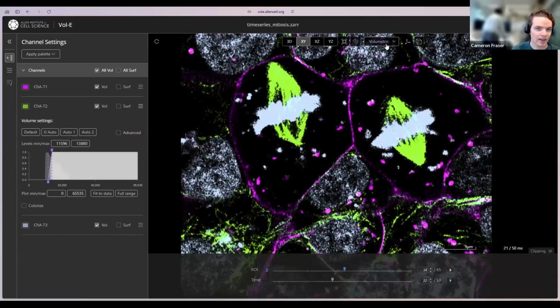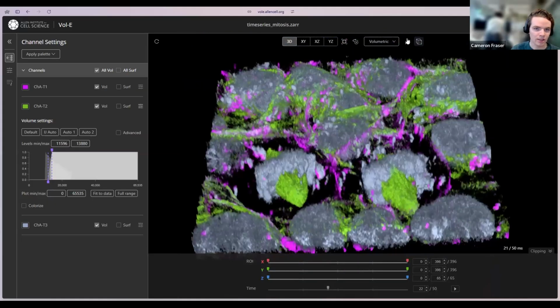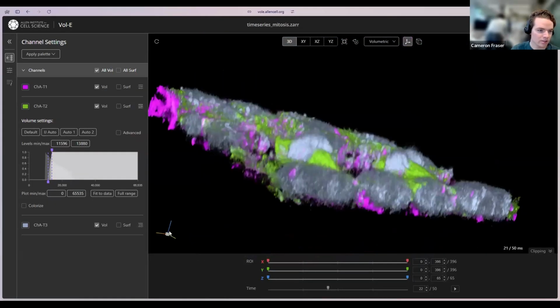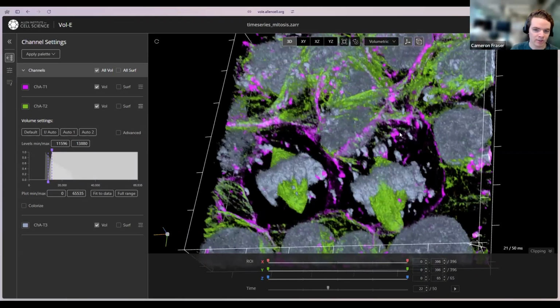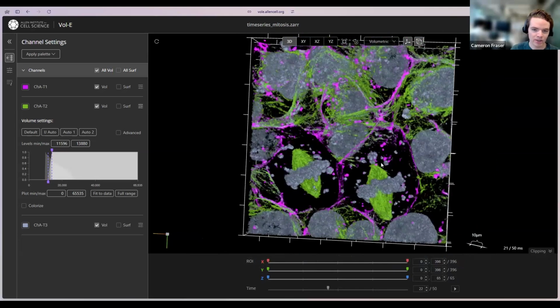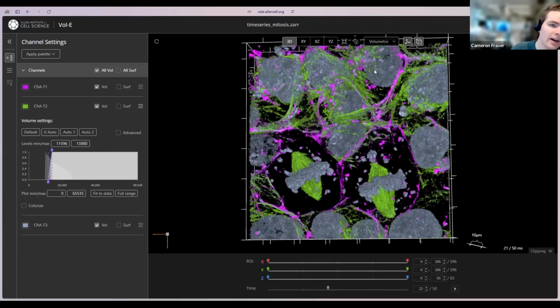So I also up here have a couple of controls for showing this little axis indicator if I'm lost in 3D space, as well as this bounding box. The bounding box is really useful for getting a sense of scale because now I have these tick marks along the edge, along with an indicator for how far apart those tick marks are spaced.